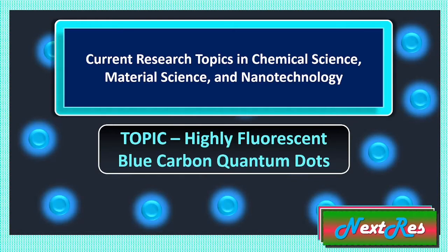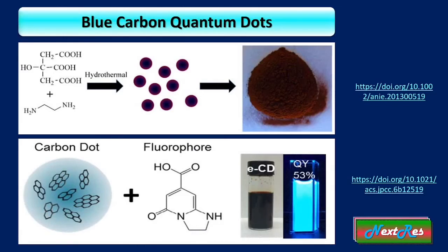Once we go deep into the literature survey, we see numerous synthesis processes for the synthesis of carbon quantum dots. Today I will tell you one very common precursor which can easily be used for the fabrication of very high fluorescent blue carbon quantum dots.